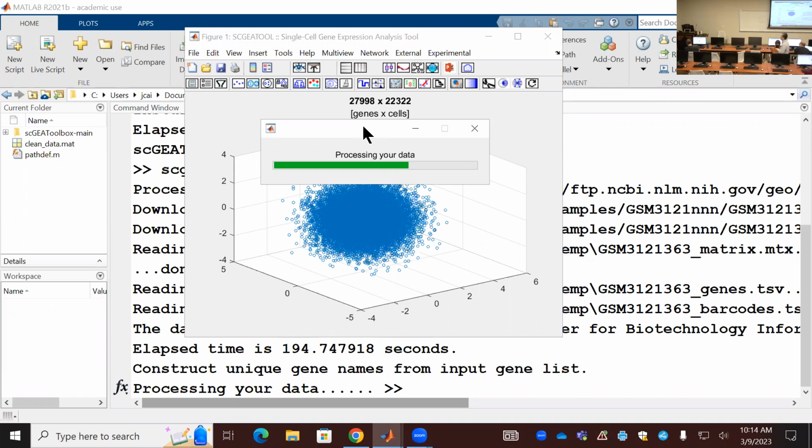It will take forever. Yes, I know. Yeah. Yes, good. I just have to wait. Yeah. Good.